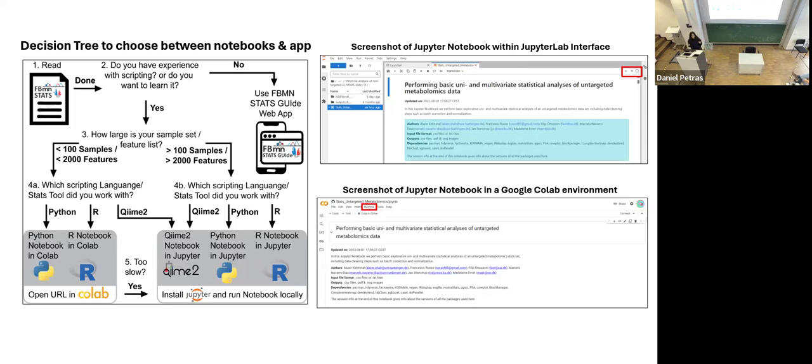And also for these projects, it's easier to share and see all the steps that they've done and what sort of results they've got with each of these steps. That is basically what Jupyter Notebook does, and it basically comes in Python format, but you could also run it in other kernels like R. And you need to install it. The installation guidelines I've provided in the protocol.